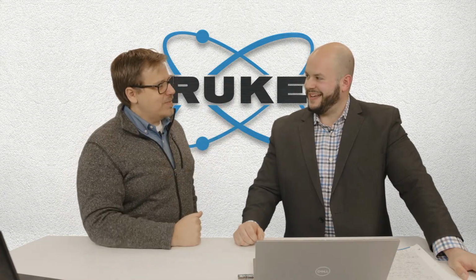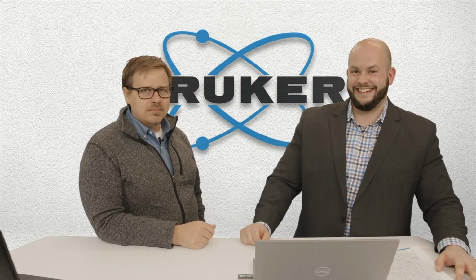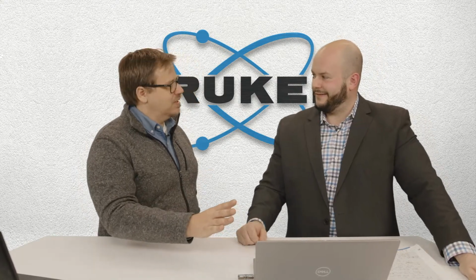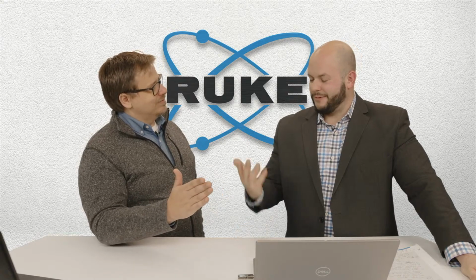As for the top end, I don't know, it's tough. One micron, I don't think you're going to hit a micron, to tell you the truth. You're going to try really hard. You might be able to see the fringes, you might be able to fit some of it. The sweet spot is 10 to 100 nanometers, generally.